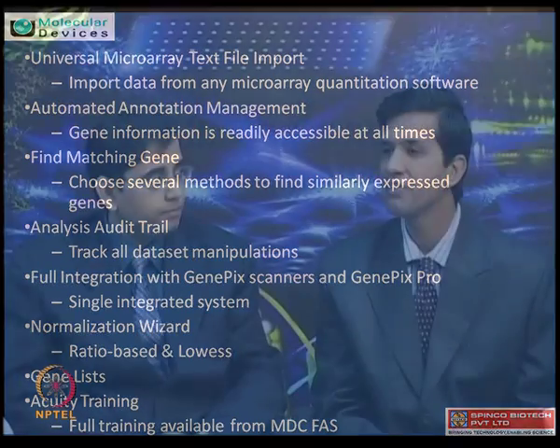Okay. So basically, if I understand, the data comes from 532 or 635, telling that it is coming from this wavelength, and still you can do the statistics. Sure. Regardless of what platform is being used, it's just the wavelength and the text file which matters here. True. And we give training at different stages also, so that one can become friendly with the software.